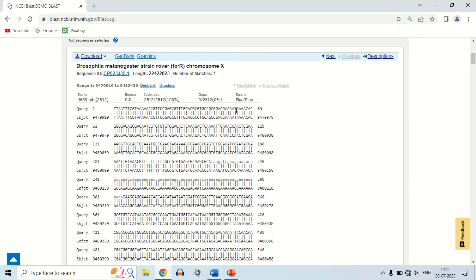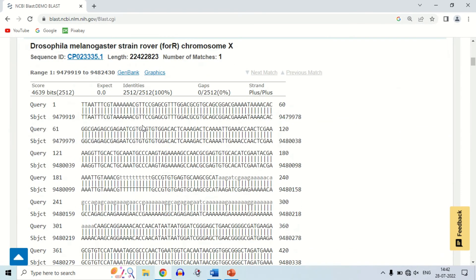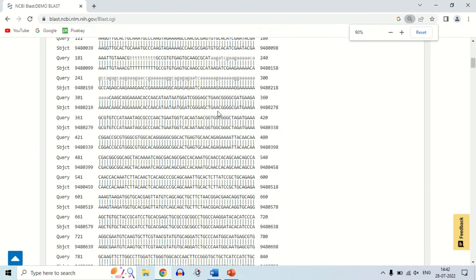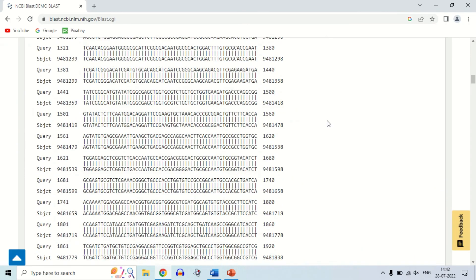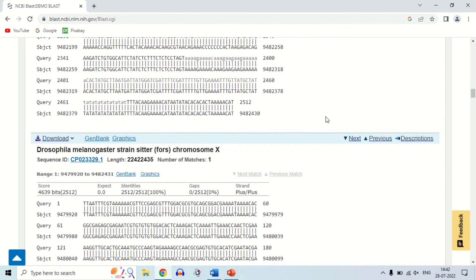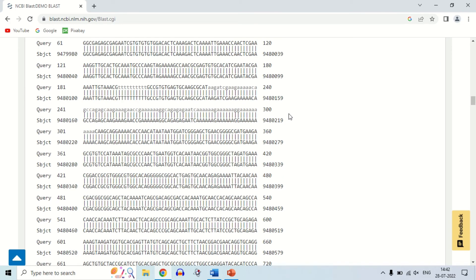Looking more closely, you can see the nucleotide bases such as TT, AT. The lines between query and subject represent similarity or matching bases. If a line is absent, it means there is a mismatch — the nucleotides in the query and subject do not match. You can scroll down to get the alignment for the next organism, again shown in segments of 60 letters per line as per the FASTA format.